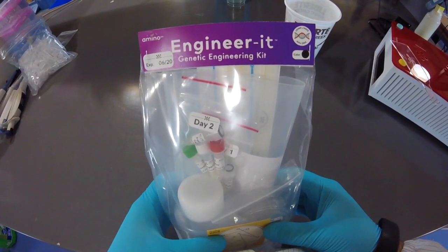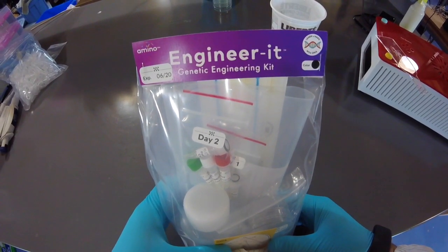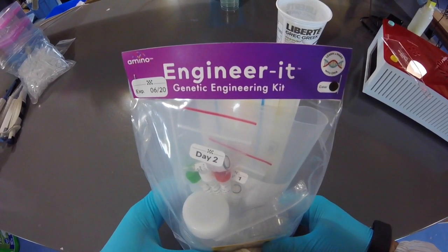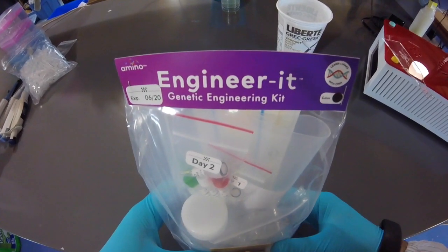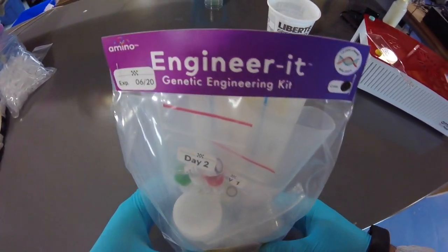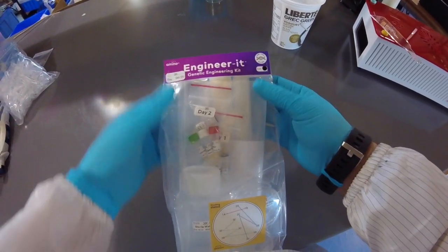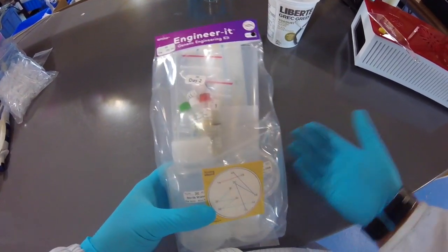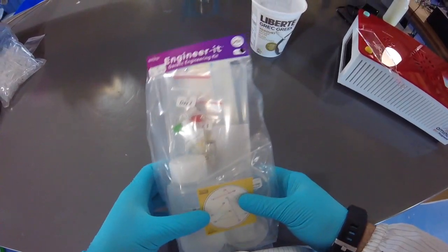Hello. Today we're going to go through the Engineer It Kit experience using the 4-day schedule, which is by far the most used for Engineer It kits, especially in the classroom, because it fits nicely into the 60-minute periods. Today we're going to be using the individually packed Engineer It kit, but if you have a group kit, it works very similar, and I'll describe a little bit more about how the group kit works as we go.